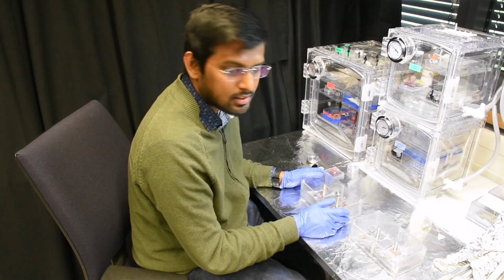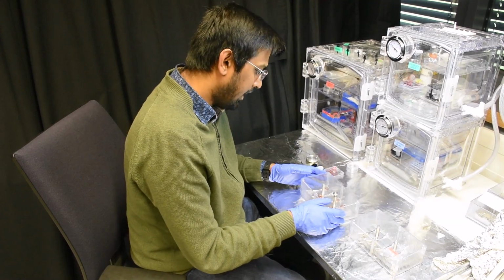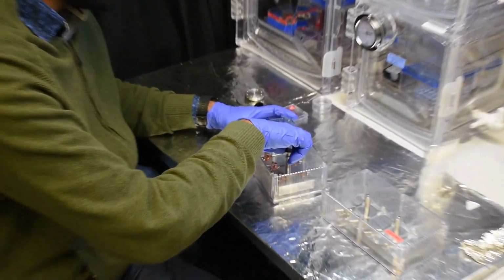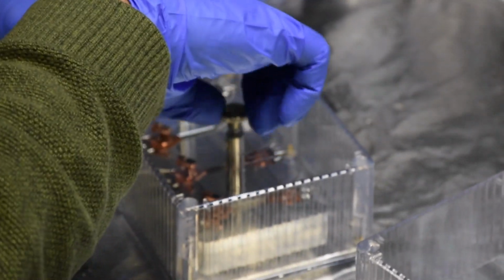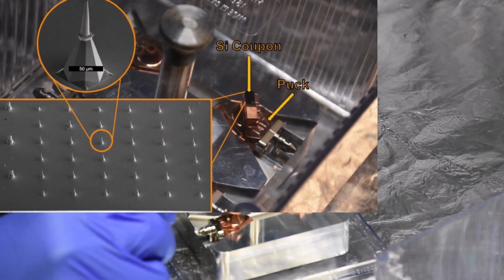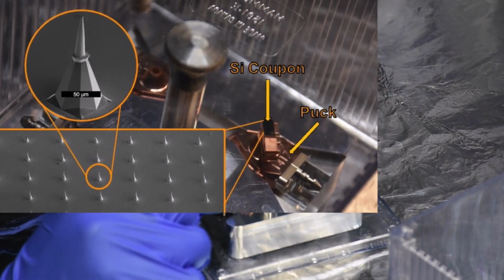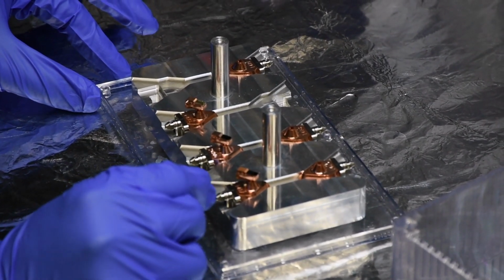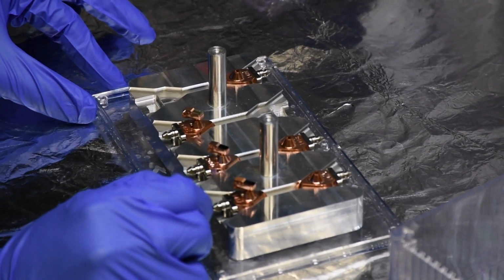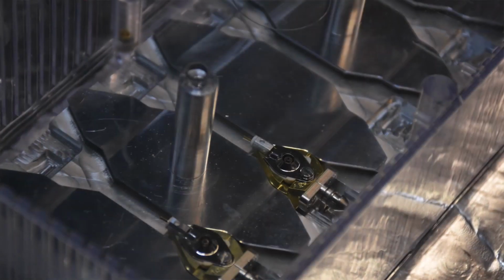So we usually make these samples through electropolishing or focused ion beam preparation. And we usually have our samples on top of these silicon coupons. So here, there is a silicon coupon which is loaded onto a puck. And the silicon coupon you can see here. And usually we load this coupon into a carousel, which I will show you next. And these are the electrodes which we use for the analysis.